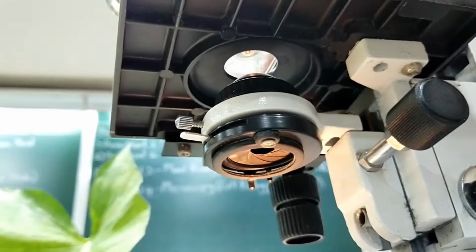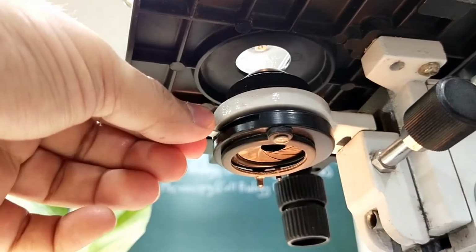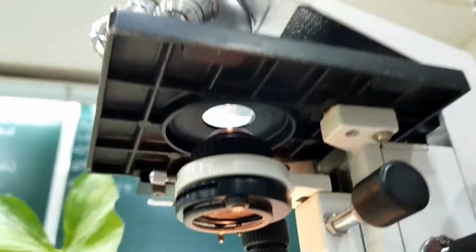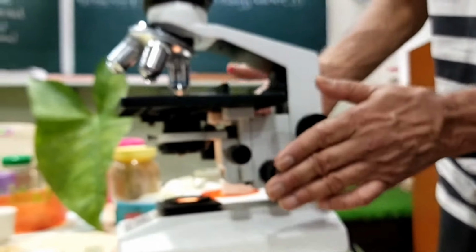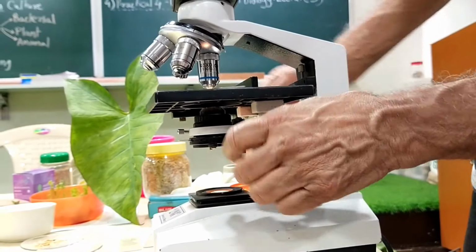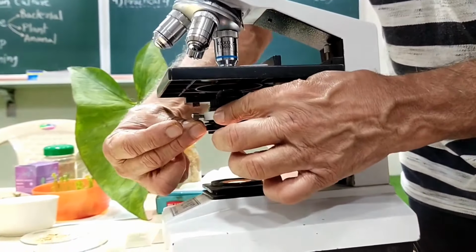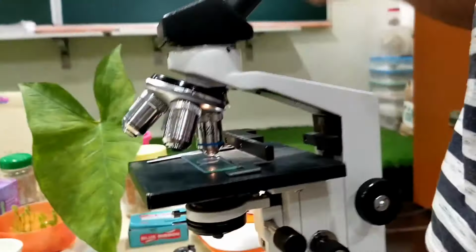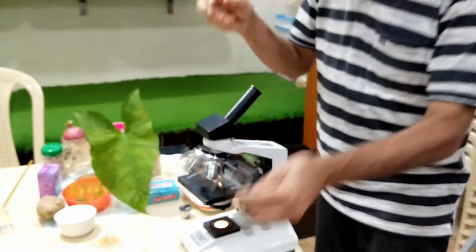All this is to adjust the light. So once again, you have the coarse adjustment, this is fine adjustment, this is the condenser lens to condense the light, and the diaphragm to regulate the amount of light that is passing. These are the main things, and now let us adjust the slide. I'll adjust the slide.